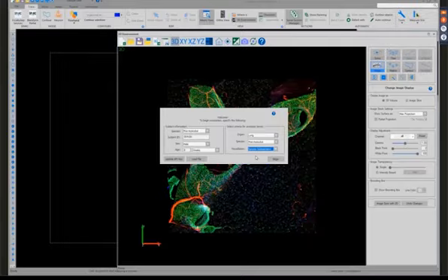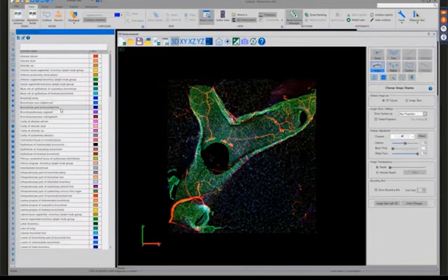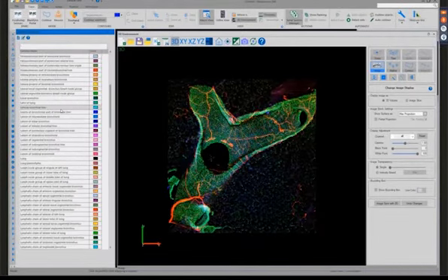You may have noticed that there was a connection alert at the bottom of the window as I filled out this field. That is the software connecting to the SciCrunch database. Each time you fill out the dialog, the software will pull down the most recent up-to-date term list. Then you'll be able to start annotating. So let's click begin. The contour selection tab will automatically populate with the anatomy term list.